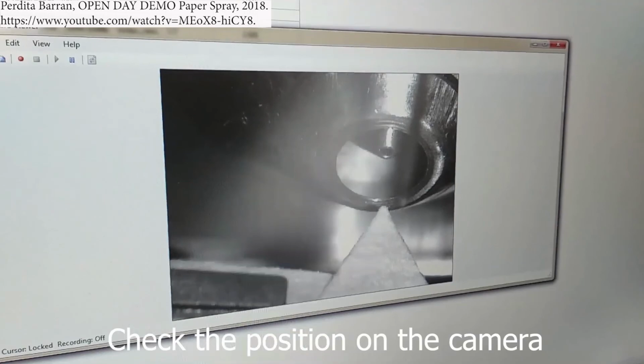surface. So paper spray has a lot of promise in toxicology, and the Netherlands Forensic Institute got pretty close to implementing it in toxicology, but they didn't meet the detection limit they needed for THC. They met the detection limit for most of the other drugs. And it also has uses for potentially defense forensics, military applications, and then conventional forensics, where you're swabbing surfaces, and then you turn the swab itself into an ion source with good sensitivity.